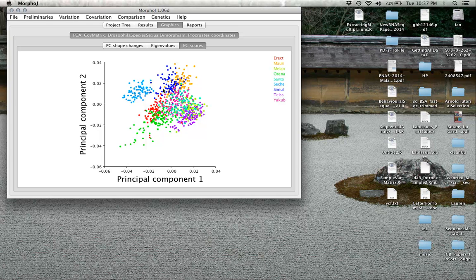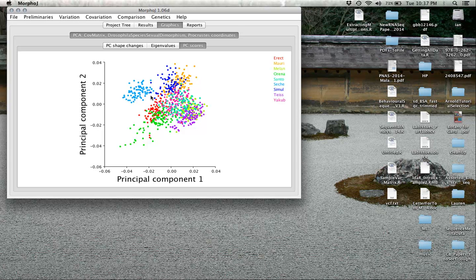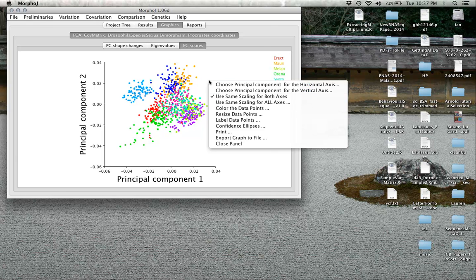When you look at Melanogaster, which is one of these faded greens, they tend all to be together. Simulans is all together, and so on. Each of these different species clusters strongly. This may not always occur. It will depend on how genetically distant and phenotypically distant some of these species are, but this is not an uncommon pattern.